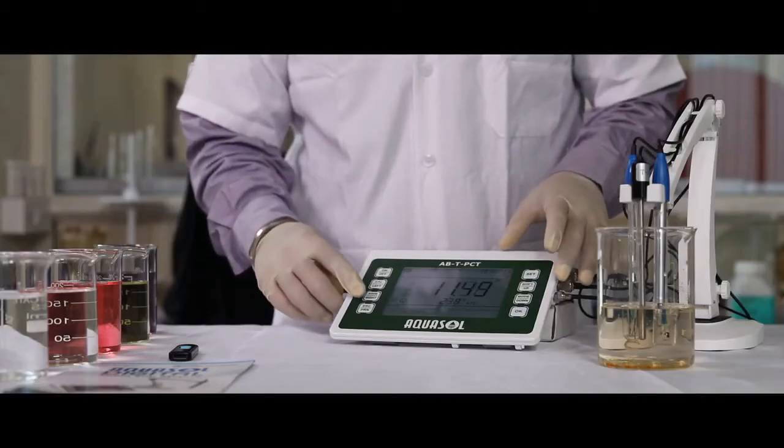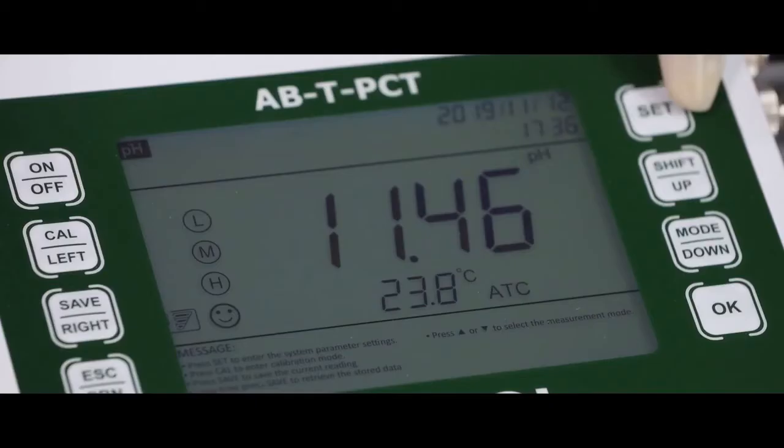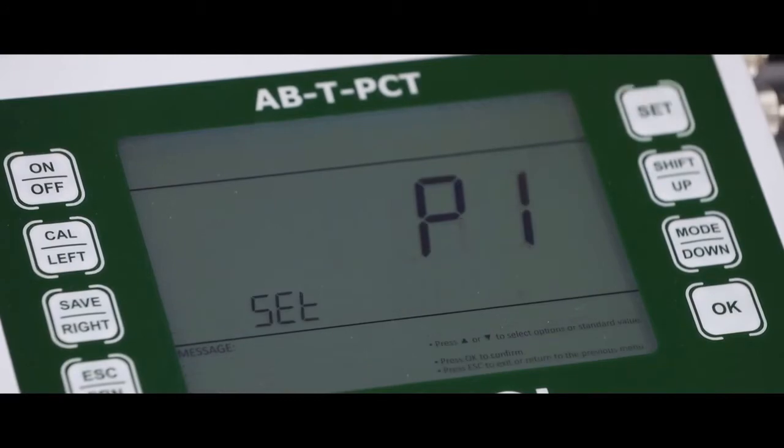To store the data, press the SAVE key. To enter settings, press the SET key.